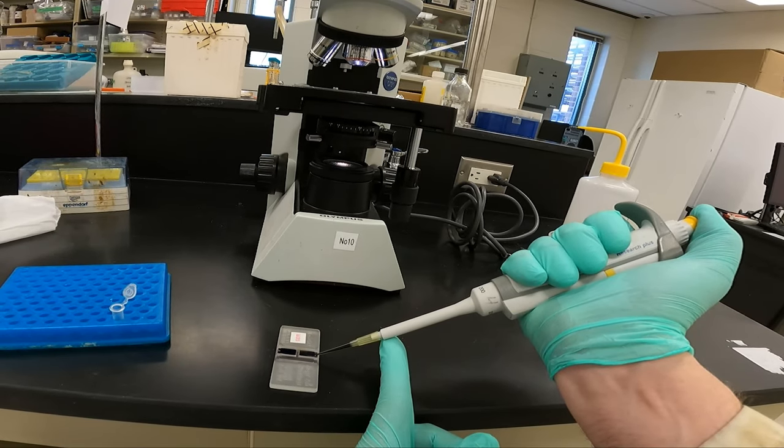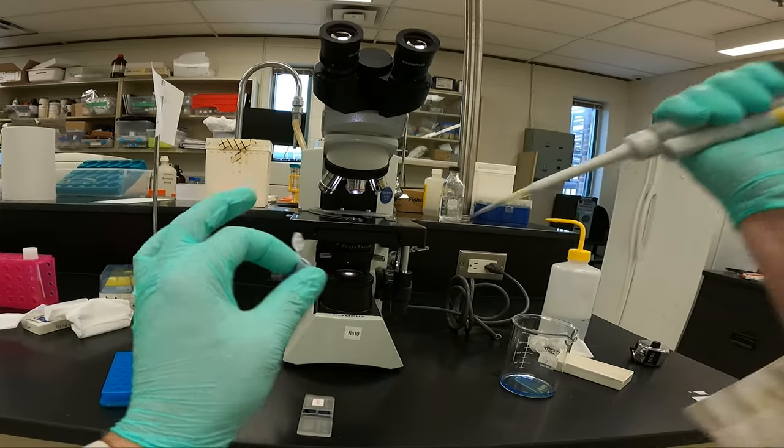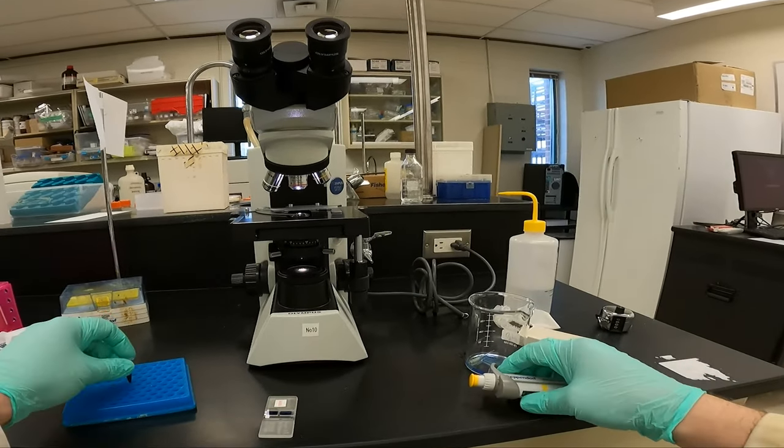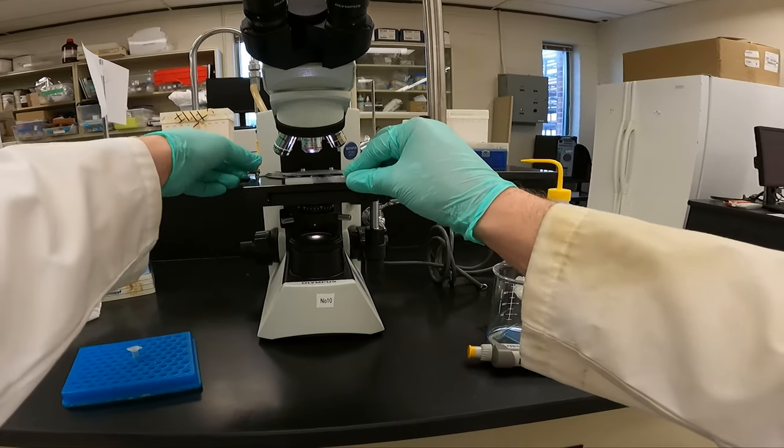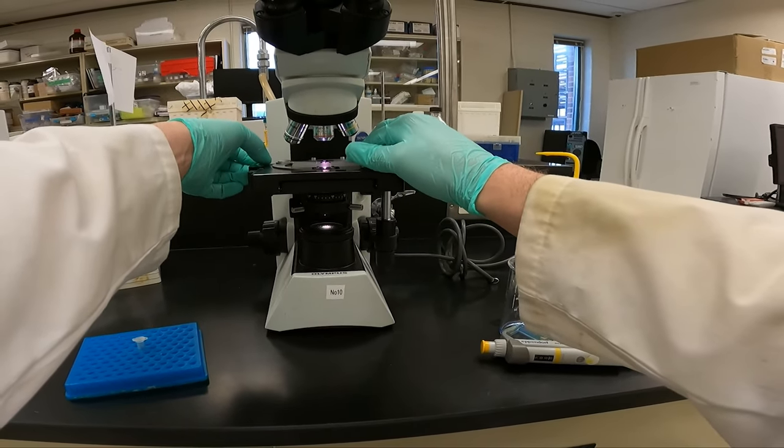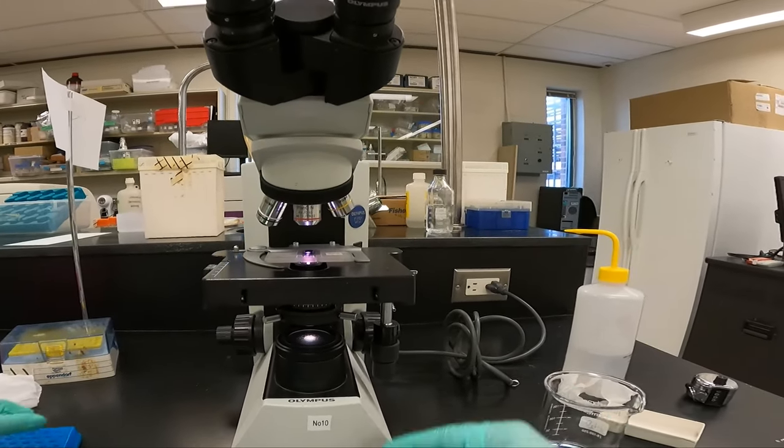If you overfill it, or there's bubbles, redo it. I'll save the extra in case I make a mistake and have to redo it. And now we're ready to count cells. Place it on the stage with the stage clamp, and then view at low magnification.